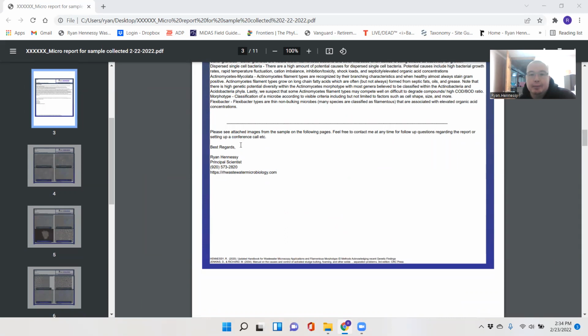Every report is also going to have on the back, feel free to reach out and we can set up a call or a Zoom meeting or something and talk about the findings.